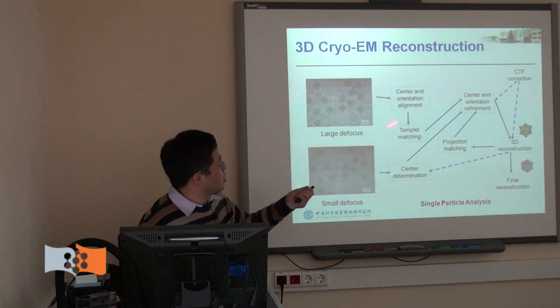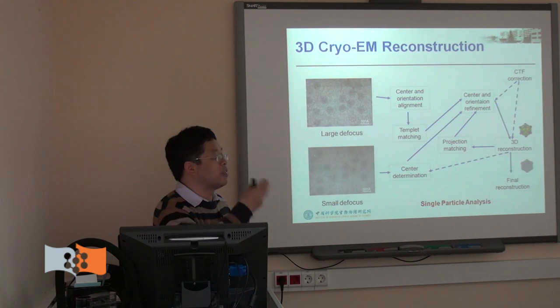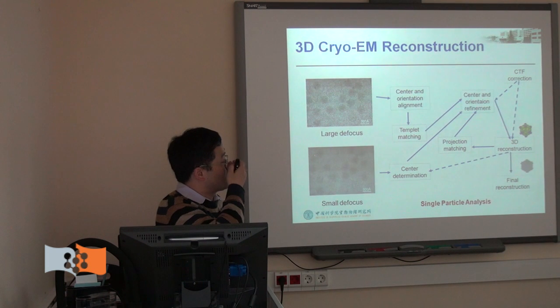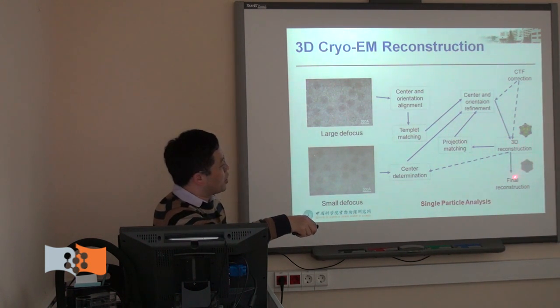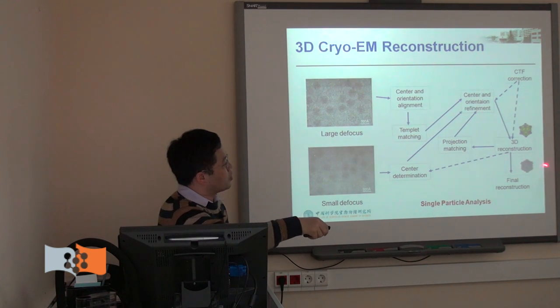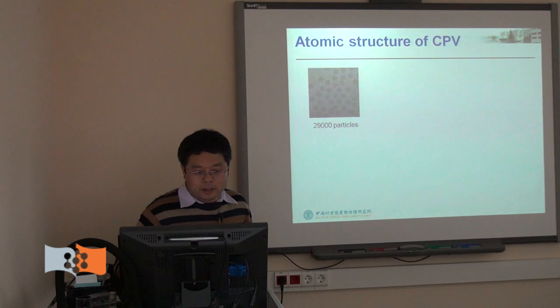I will skip this slide, but the idea is what I mentioned in the last session: get an initial model and then refine it to get the final reconstruction.